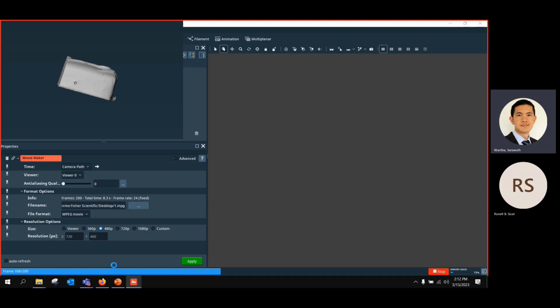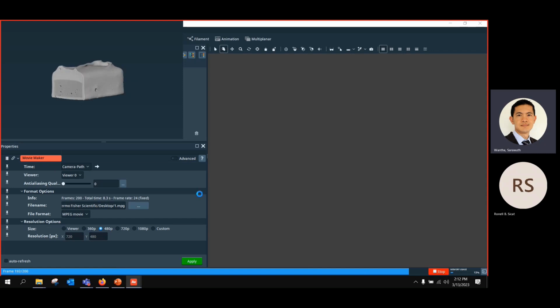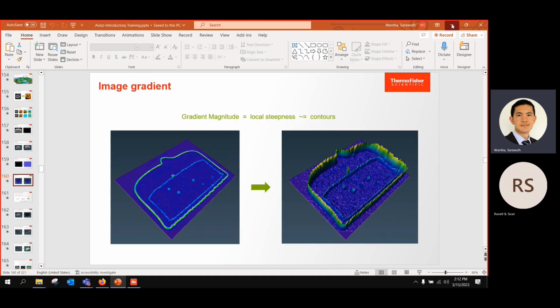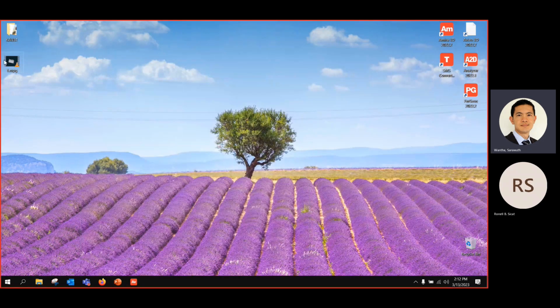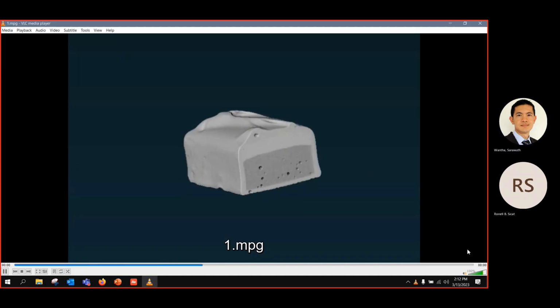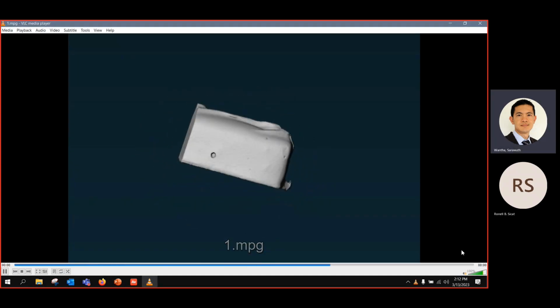So you just rotate around to see, zoom in, zoom out. The next one will be a bit more complicated, but I also have all the instructions in the slides that I'm going to send to you, so don't worry. Just wait 1-2 seconds. Now I'm ready with the animation. Maybe just take a look at the results. This one. You can see, yeah, that's what you created.